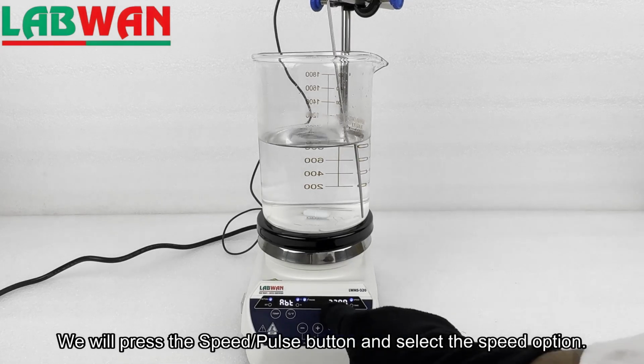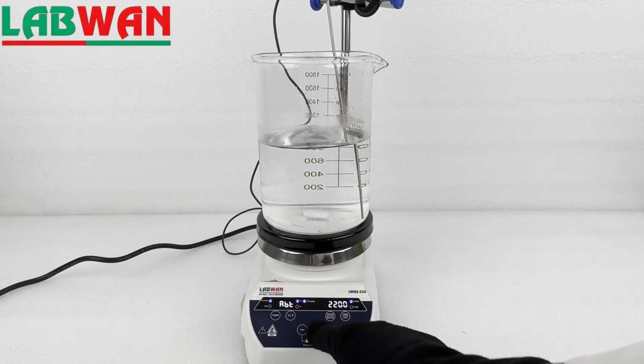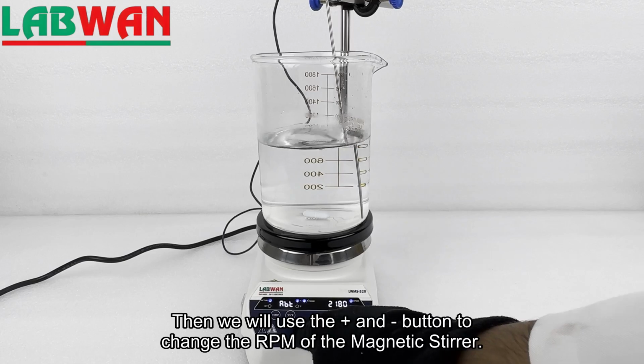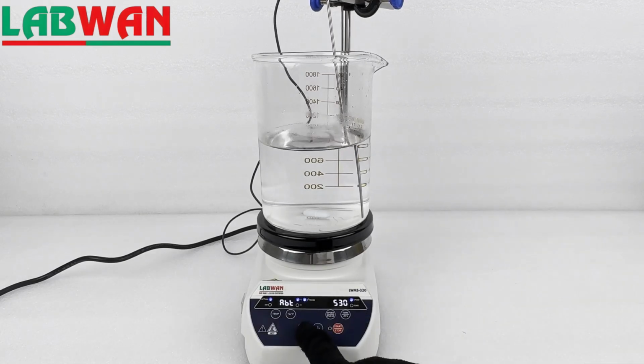We will press the speed, pulse button and select the speed option. Then we will use the plus and minus button to change the RPM of the magnetic stirrer.